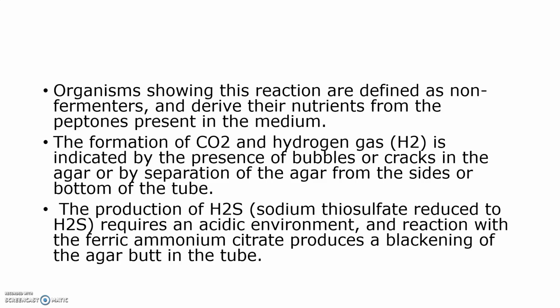Another indication is the production of hydrogen sulfide, which means sodium thiosulfate is reduced to hydrogen sulfide. It requires an acidic environment for this hydrogen sulfide production. The reaction with ferric ammonium citrate, present in the medium, produces a blackening of the agar. As a result of the hydrogen sulfide production, the butt becomes black in color.